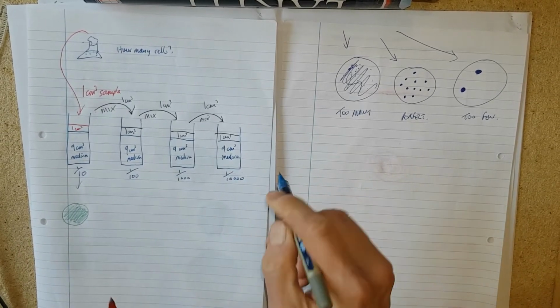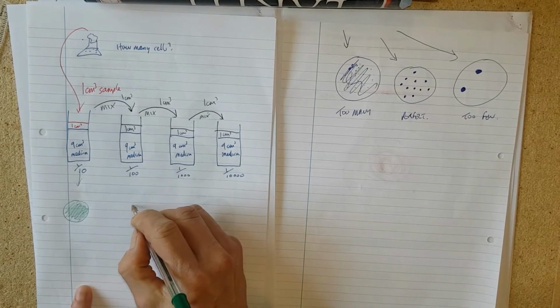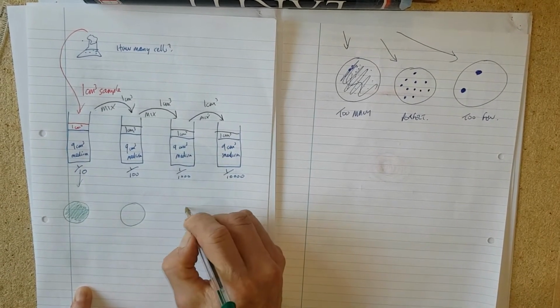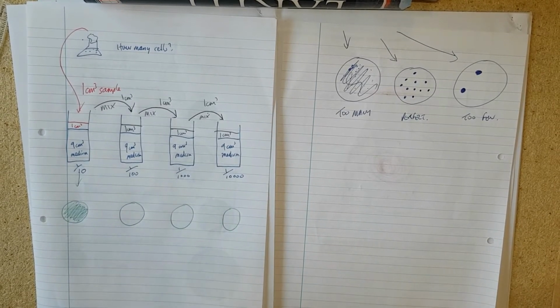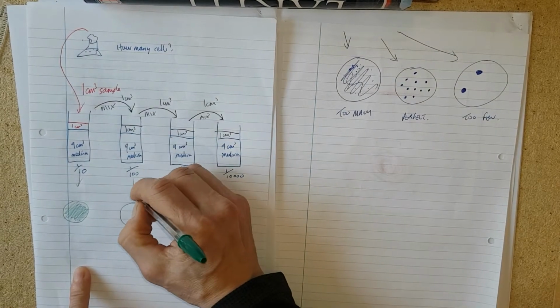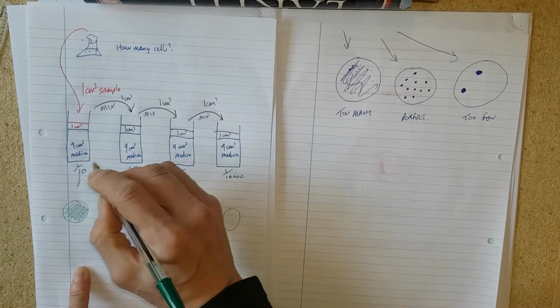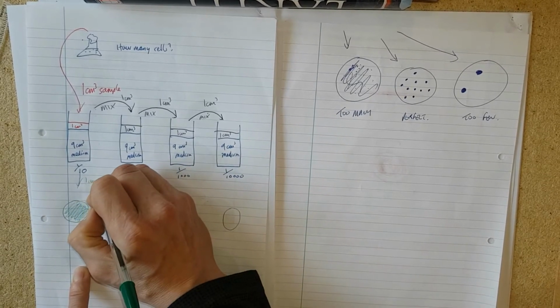And you can actually keep going with some more tubes. When you make the plates for these, what you're going to do to make these plates, you take perhaps, say, 1 cm cubed each time.